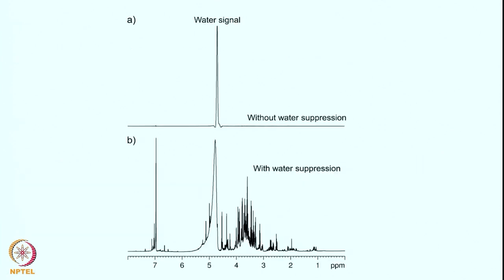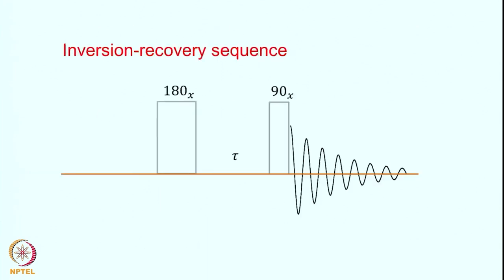This is the same spectrum shown in the previous slide, and this is the result with water suppression by pre-saturation. Here you see the water signal is substantially reduced, and you are able to see the other signals of the sample — this is a spectrum of a protein — and you are able to see those signals with good intensities. This is one technique to suppress the water.